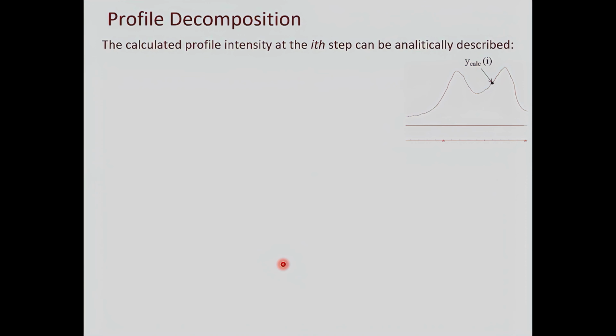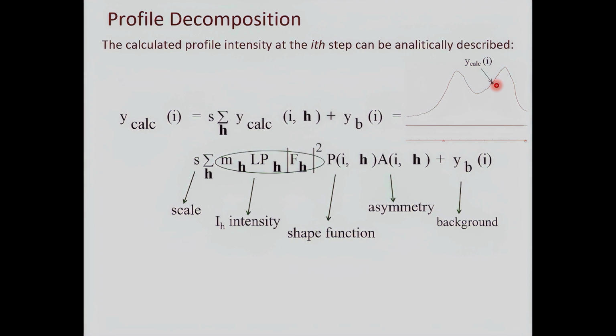We have understood that it's important to try to make the minimum error when we try to calculate the position of a peak or its integrated intensities. For example, then what do we do? In this case, if we have this collected, observed diffraction effect, and I want to calculate the profile intensity calculated at this point, I use this formula that Paolo will explain better in his lesson.